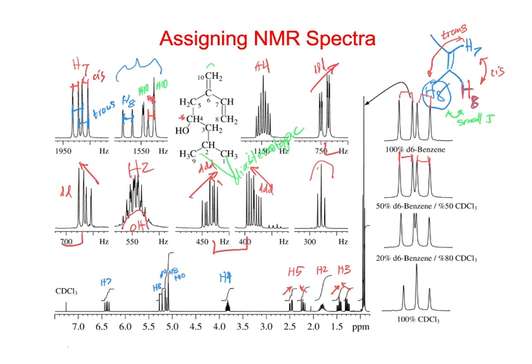Okay? Notice that these second order ones here are going the other way. But there's nothing really over there, because that's here. So maybe that didn't work on those though. But yeah, sometimes it's not just the whole thing slanting in one way. If there's more than one coupling, one could be slanting this way and the other smaller couplings could be going this way. Right? So sometimes that's some bit of information that you can gather as well.